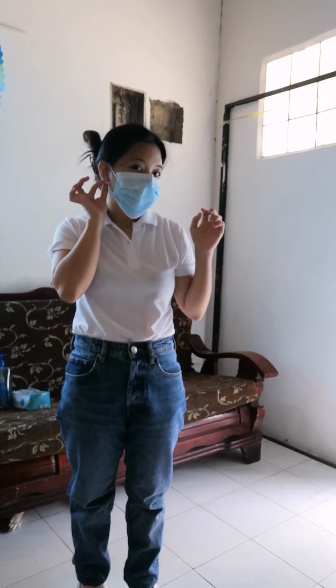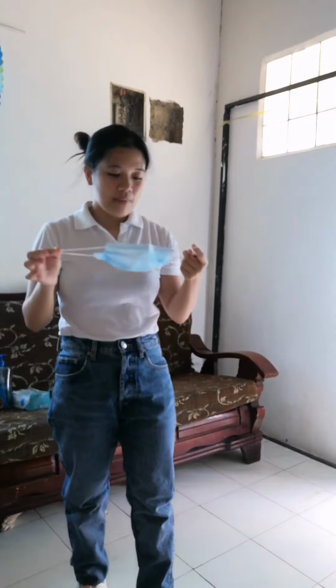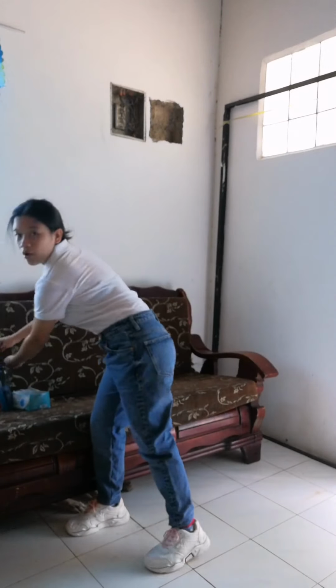So next is to doff our mask, touching the sides of the mask, the elastic part, because grasping the elastic part is the proper way of removing the mask as per the protocol, because the front part of the mask has too much exposure and has a lot of microorganisms present. And lastly is to perform hand hygiene. Of course, this is to prevent contamination, or we can use an alcohol-based sanitizer.